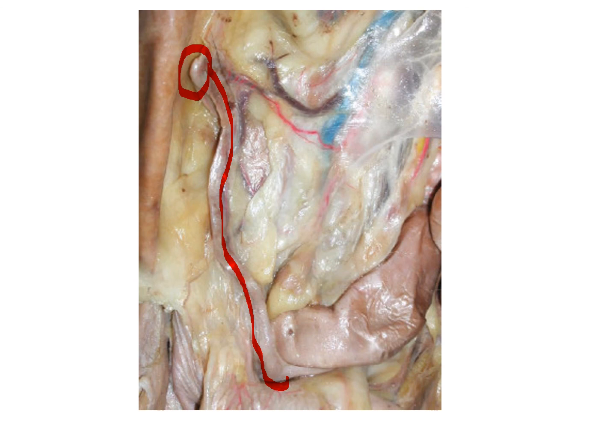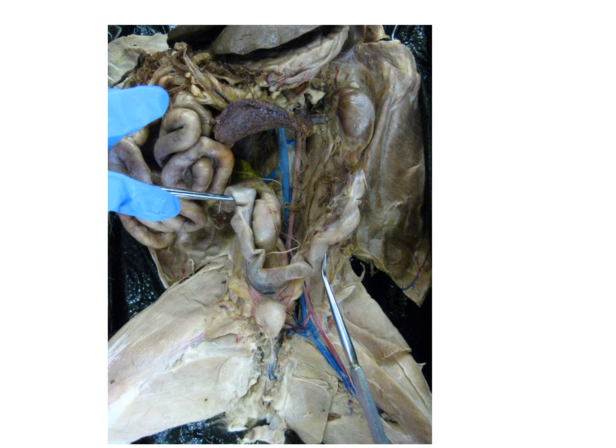I'm going to show you another picture of the uterine horns of a freshly impregnated but dead cat. That would be this one. So here you can see the bladder. And you can see how swollen these uterine tubes are.